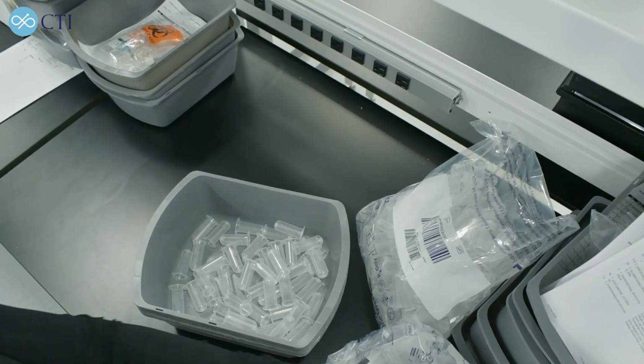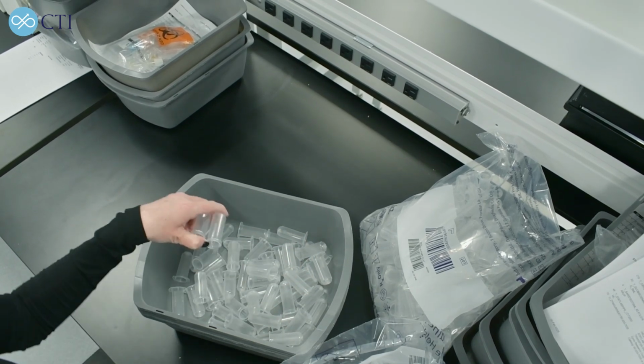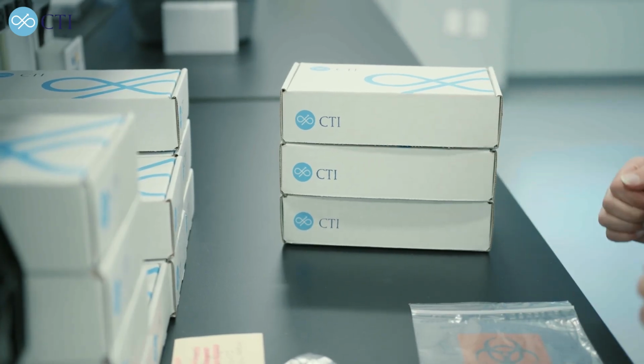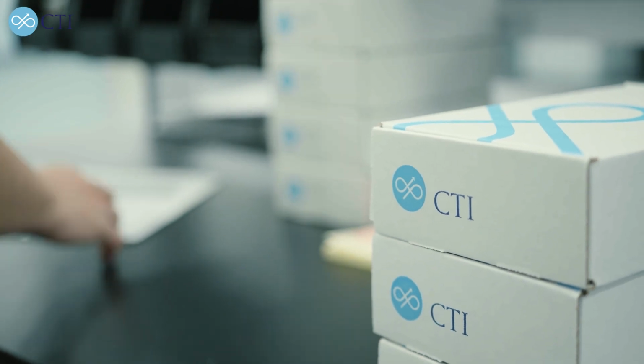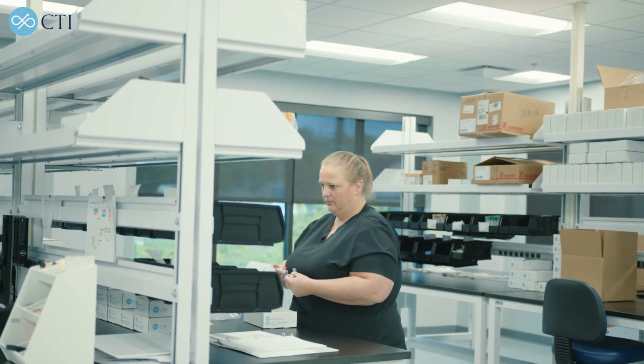The important part, and what our kitting team must do, is take the information from the study build, develop the specifications for the kits, build those kits, and then QC those kits before sending them out so that we can ensure that there's global consistency from anything provided from our US facility or our Spain facility for global studies that have investigator sites throughout the world.